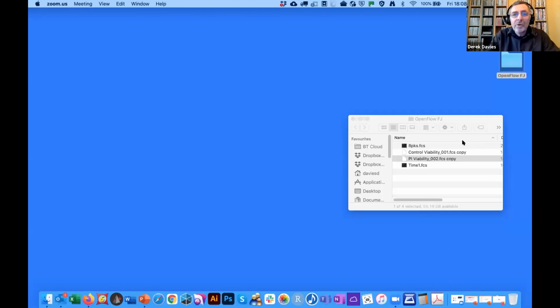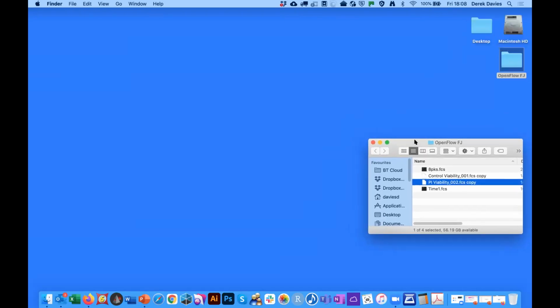Okay, so I'm going to share my screen, but this time I'm going to share the whole of my screen. One thing I found with these sort of demos is that, can you see my screen, first of all? That's one thing. Kathy, can you just confirm that you can see that? Right, okay, good. We can see the screen. Good, nothing on there yet, not much on there.